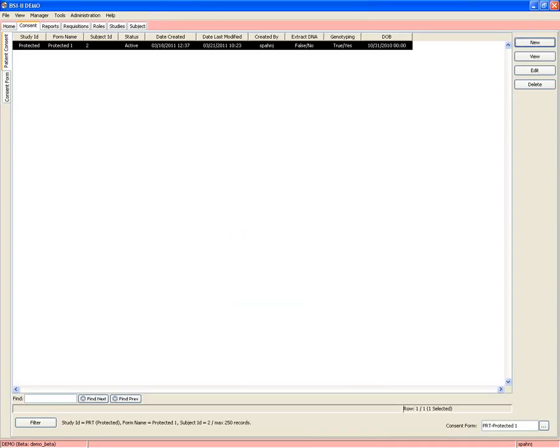Is the destruction date area only available with the addition of the consent module? Yes, I believe so. It's a consent addition. But I will certainly check, and if we do give it to you regardless, I'll let you know when I publish the answers to these questions.